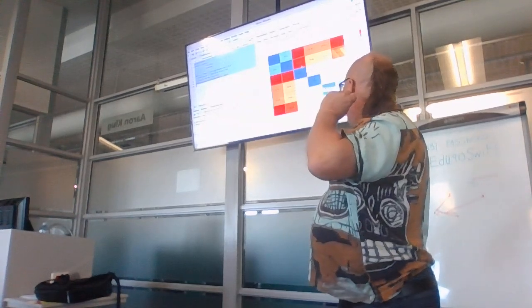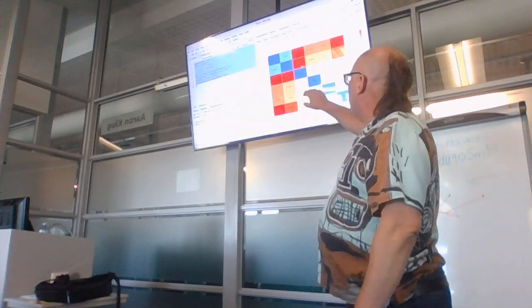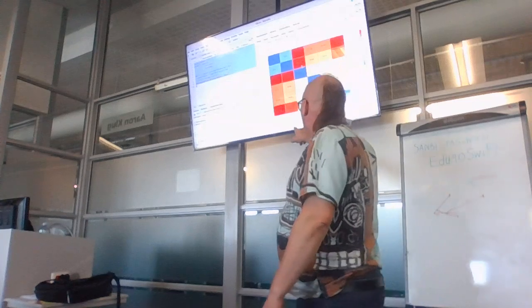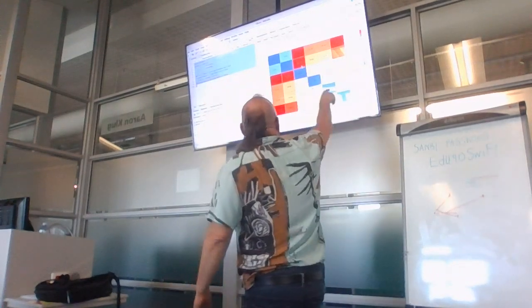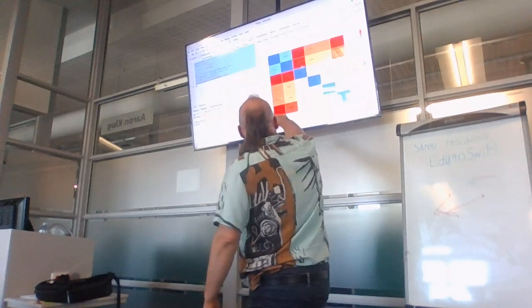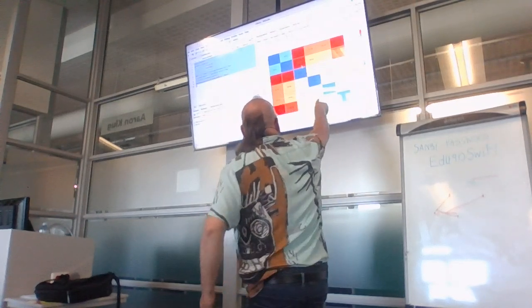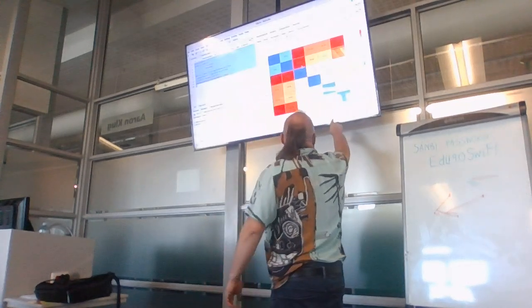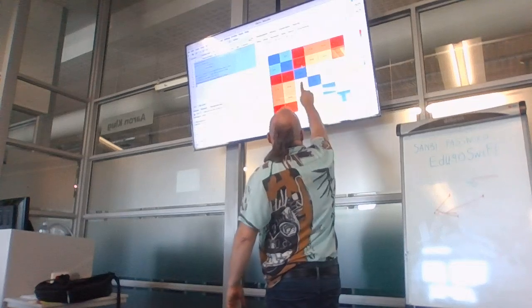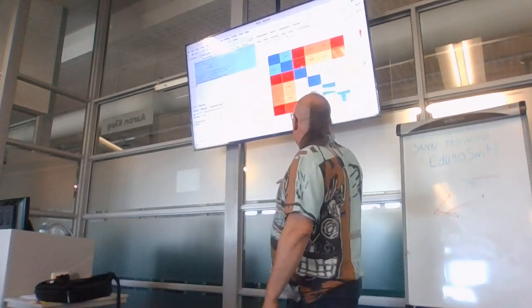And the other thing that we see is that if we look at the difference between 364 and the reference, it's 24, and 260 to the reference is 25. But if we look at this other clade over here, 370, 253, and 373, they are 15, 13, 16 from the reference, okay?